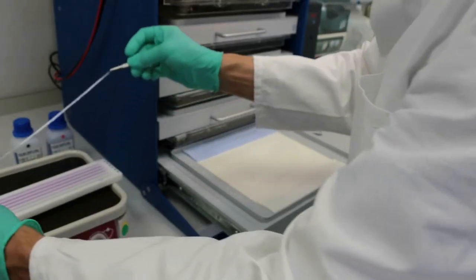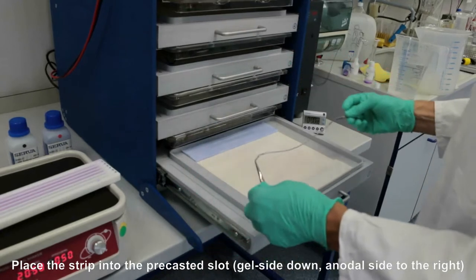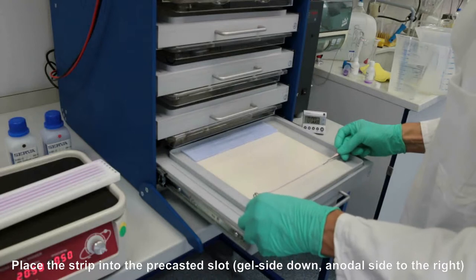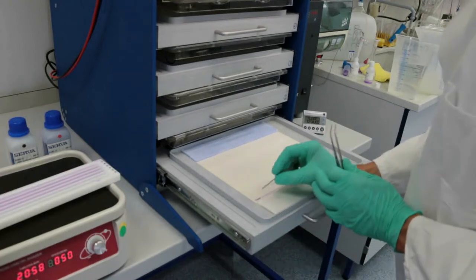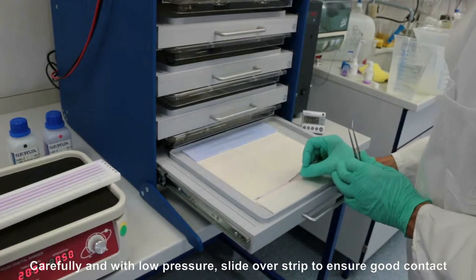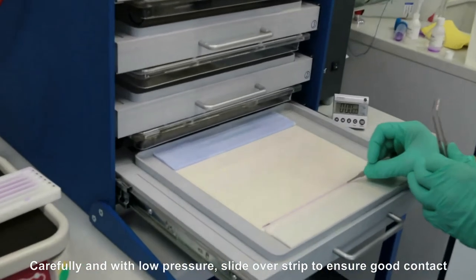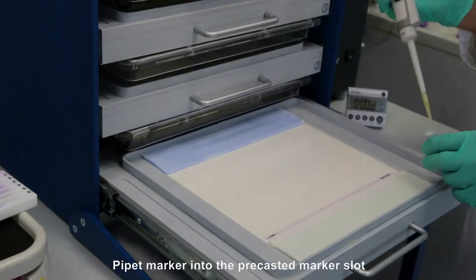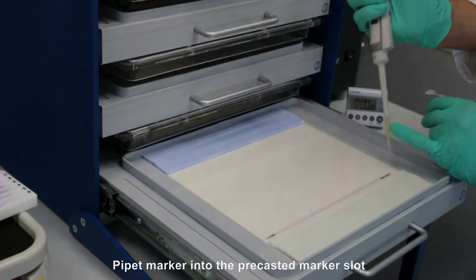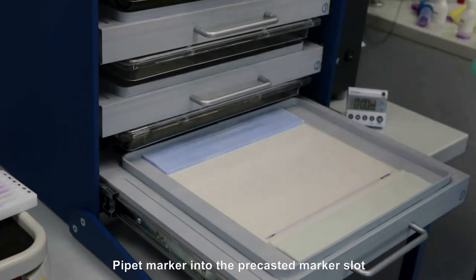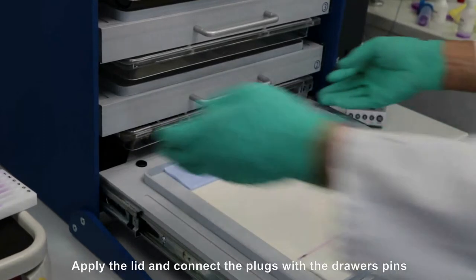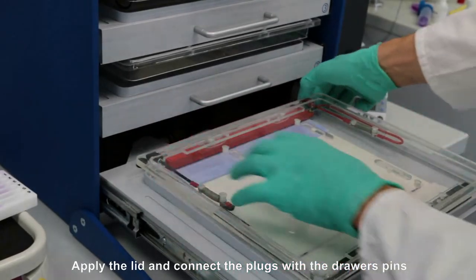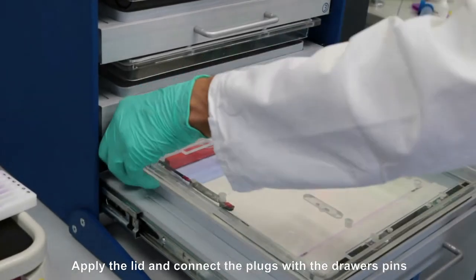Place the strip into the pre-casted slot, gel side down and the anodal side to the right. Carefully and with low pressure slide over the strip's backing to ensure good contact. Pipette marker into the pre-casted marker slot. Apply the lid and connect the lid's plugs with the drawer's pins.